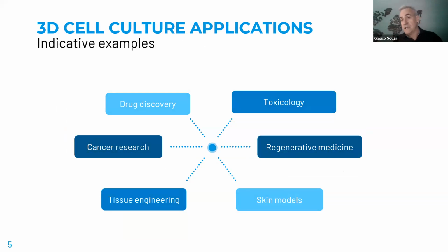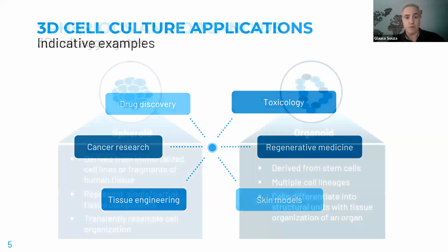And even the FDA now has the FDA Modernization Act, which actually allows the use of 3D models to replace animal use. So it's a meaningful breakthrough for 3D cell culture. And of course, skin models, regenerative medicine, creating tissue is where we apply 3D cell culture.